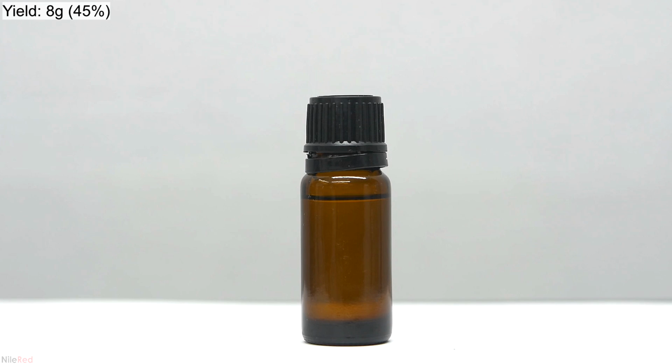The major loss is probably due to water being present and destroying some of the Grignard reagent. To have the most efficient reaction possible, we usually need to have the lowest water content possible, and this involves a lot of work. It usually involves drying all of the solvents and reagents overnight and then redistilling them. I'm not selling any products or doing any research, so this really wasn't necessary for me.